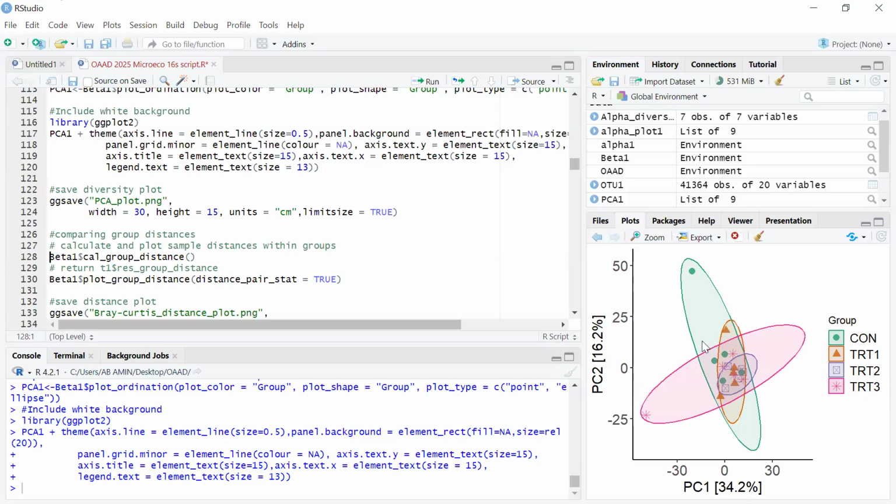Yeah, actually, I don't understand the question. I think the question he's trying to ask is how do you differentiate between PCoA and PCA? One of the things I took away from your explanation is that it has to do with the approach or methodology through which the result is generated. For example, the PCoA is generated using Bray-Curtis, but the PCA here is generated using Euclidean distance. So based on that, there's likely to be some slight differences.